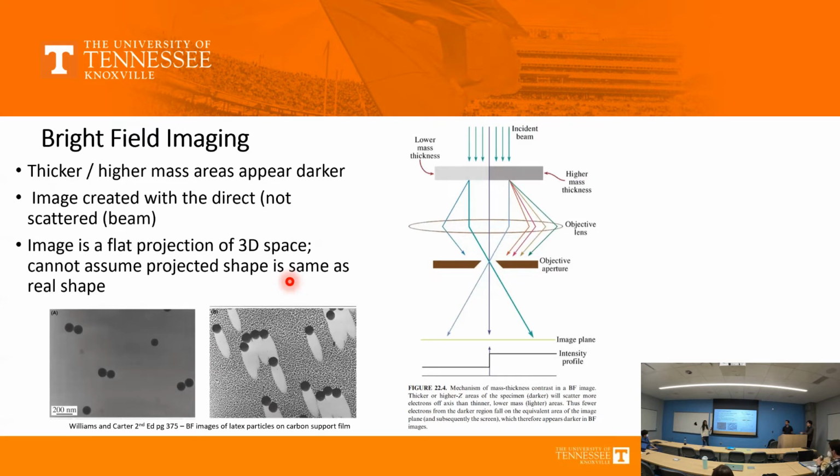There are samples which have precipitates in them. We take that sample and put it into a little instrument where carbon is deposited on the surface. Then we try to etch the sample, and the carbon layer becomes separated from the sample and contains the precipitates. It's a very common technique.